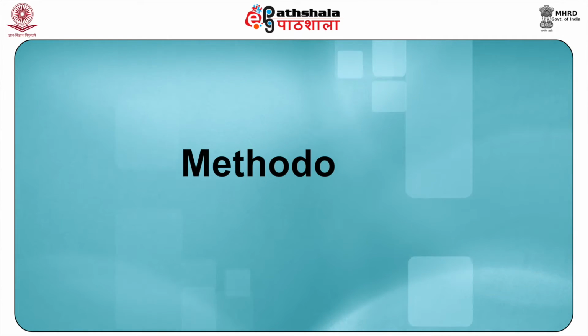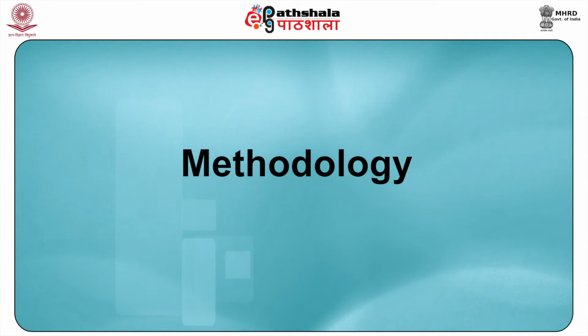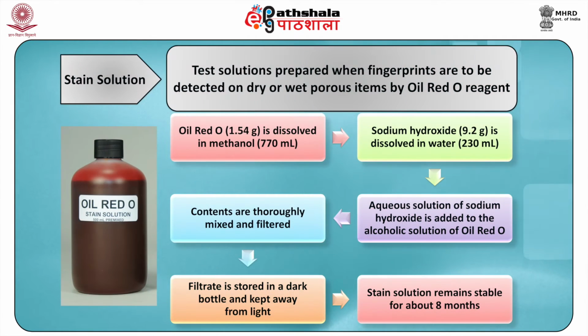Now, let us see the methodology. Two test solutions are prepared when fingerprints are to be detected on dry or wet porous items by oil red O reagent. A. Stain solution. It is prepared by the following steps.